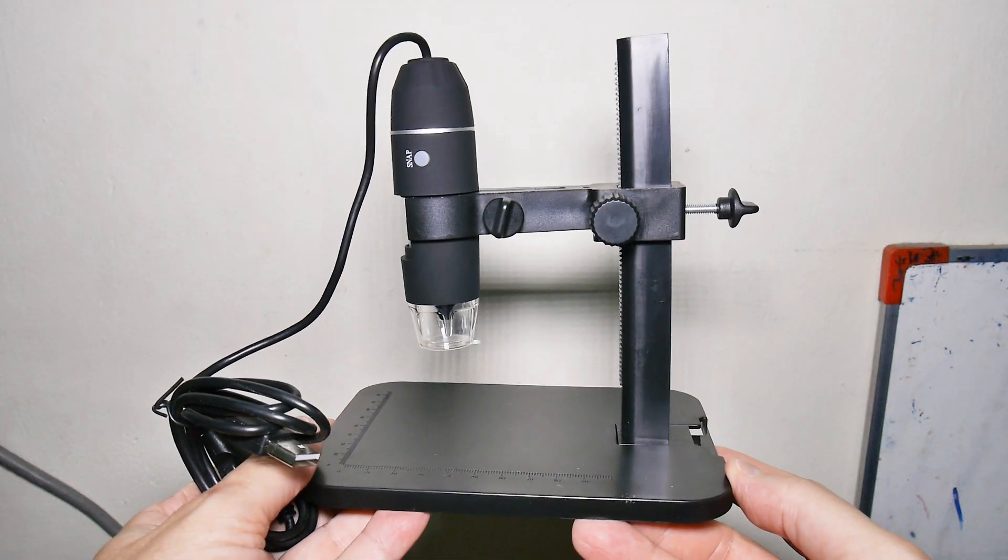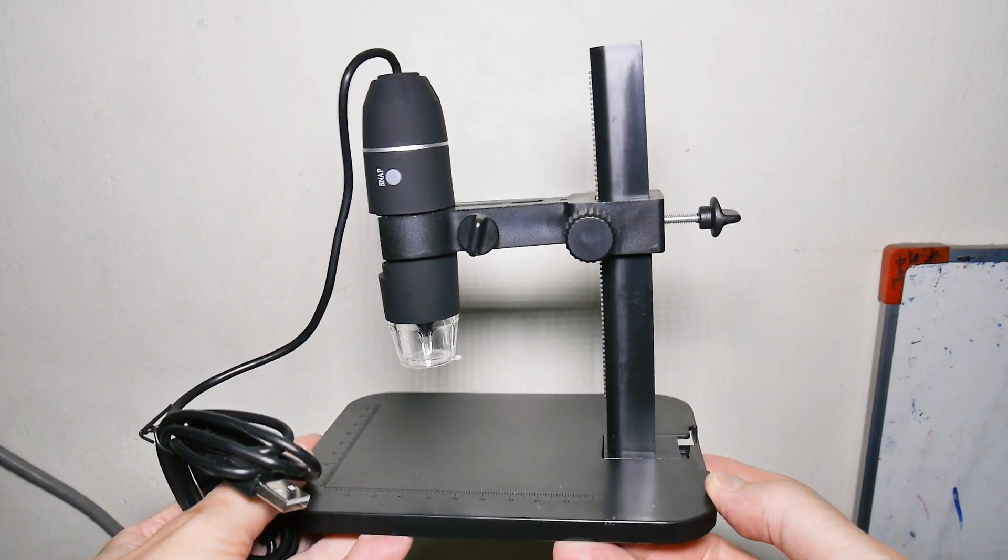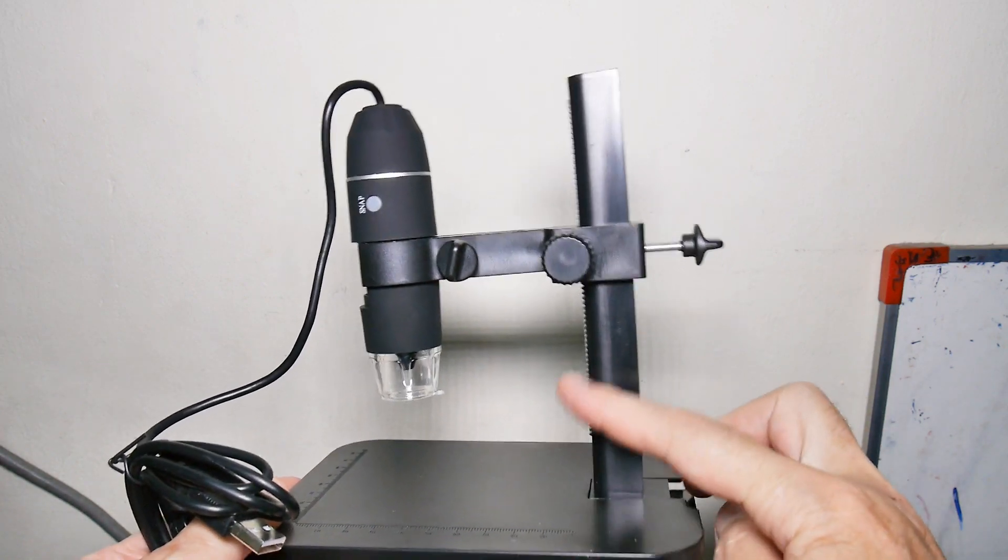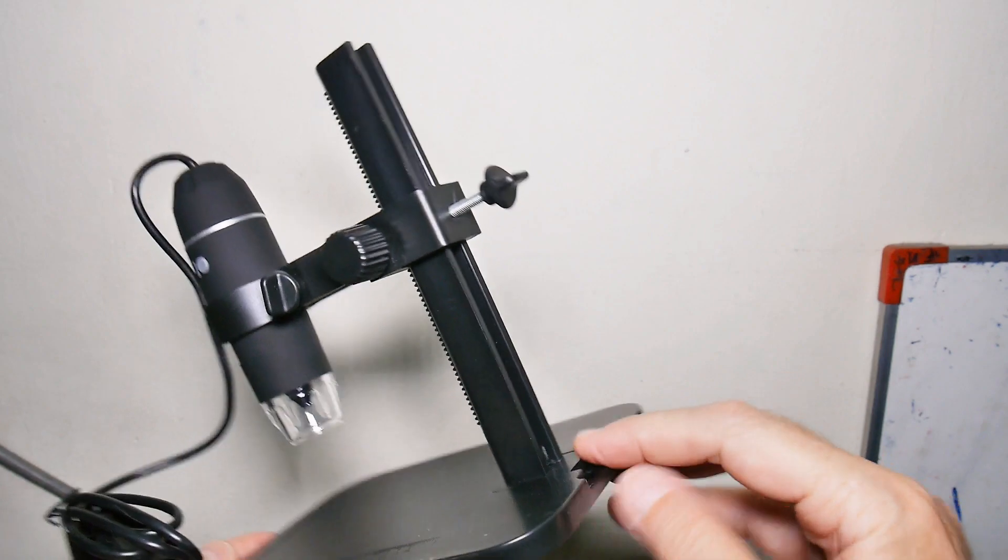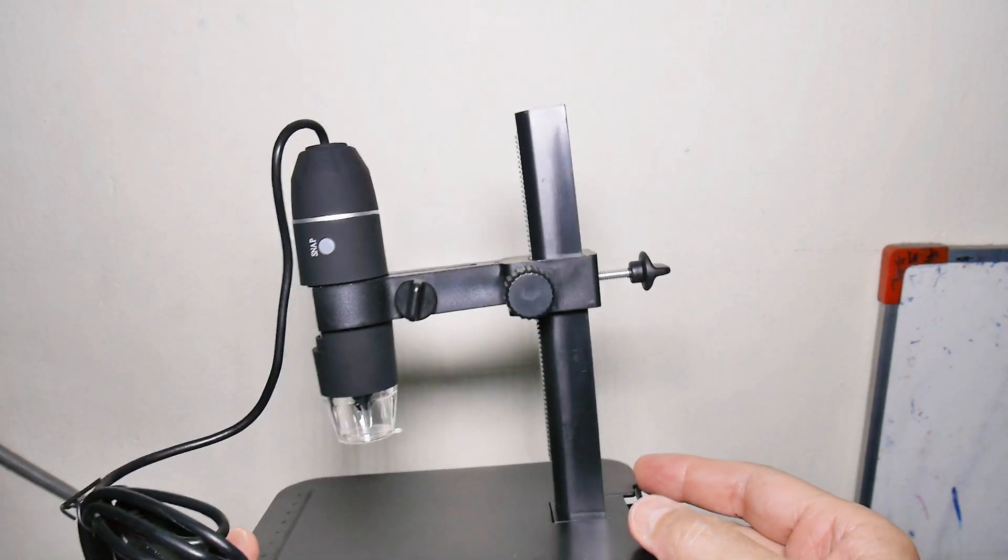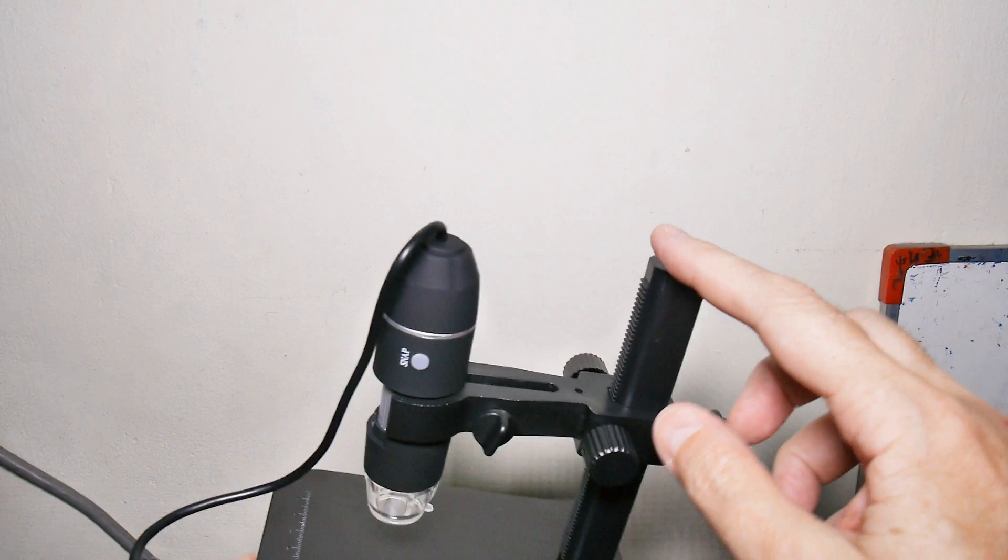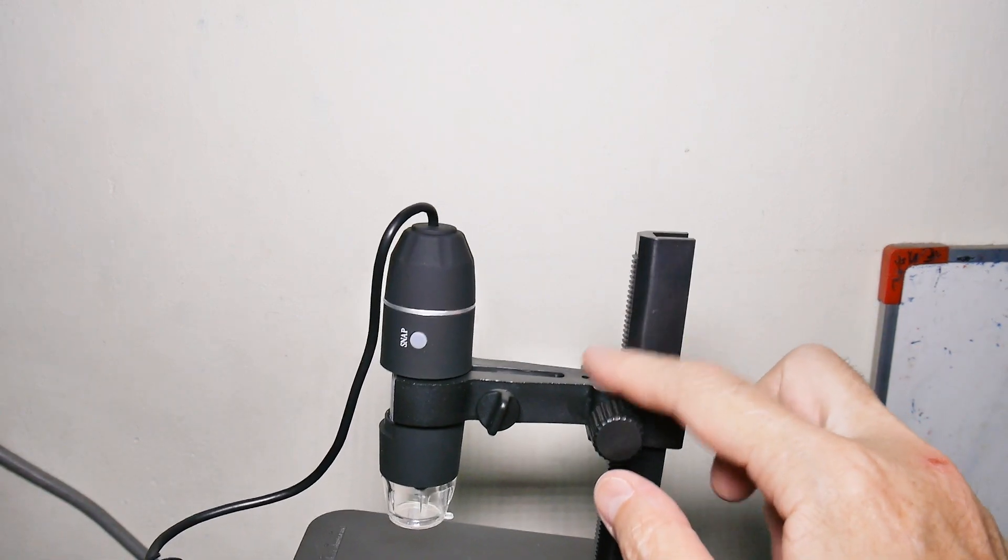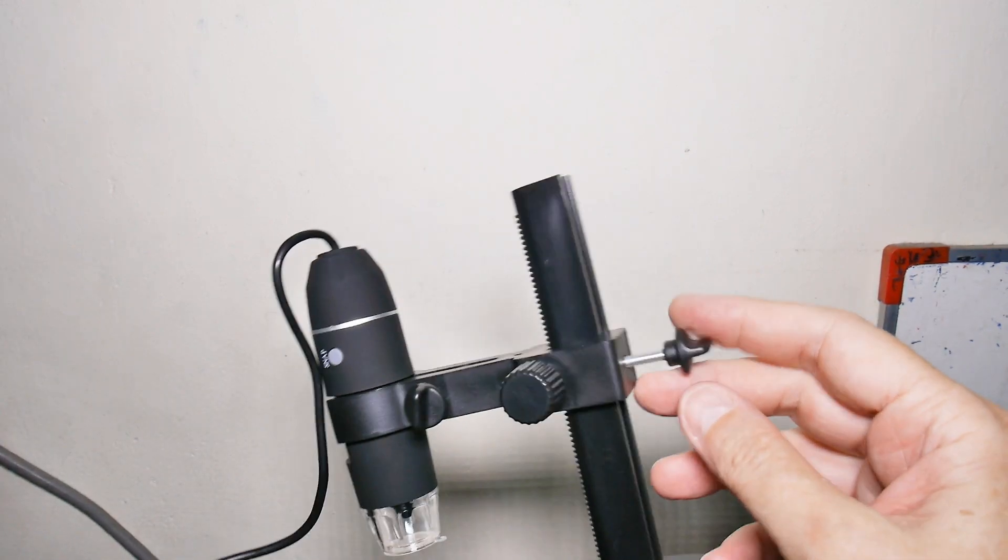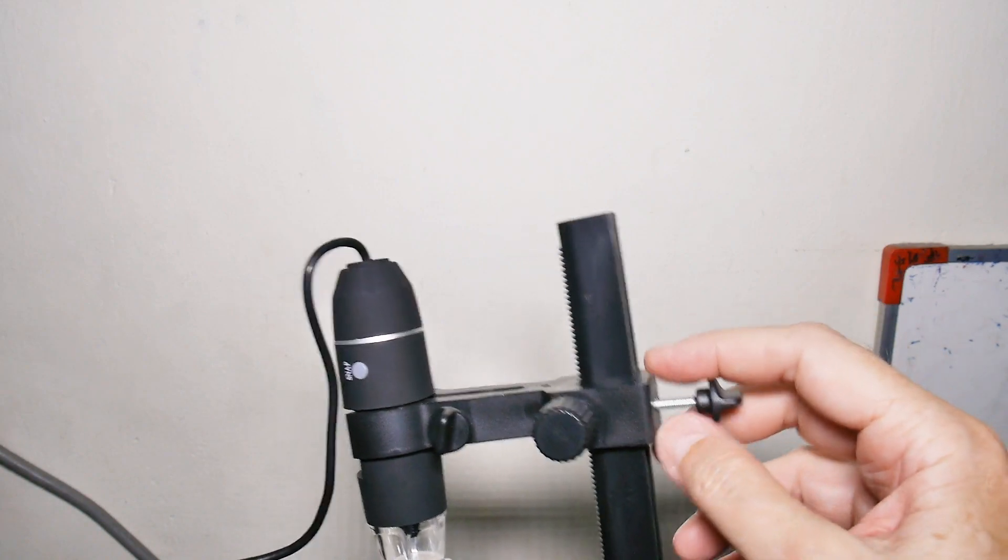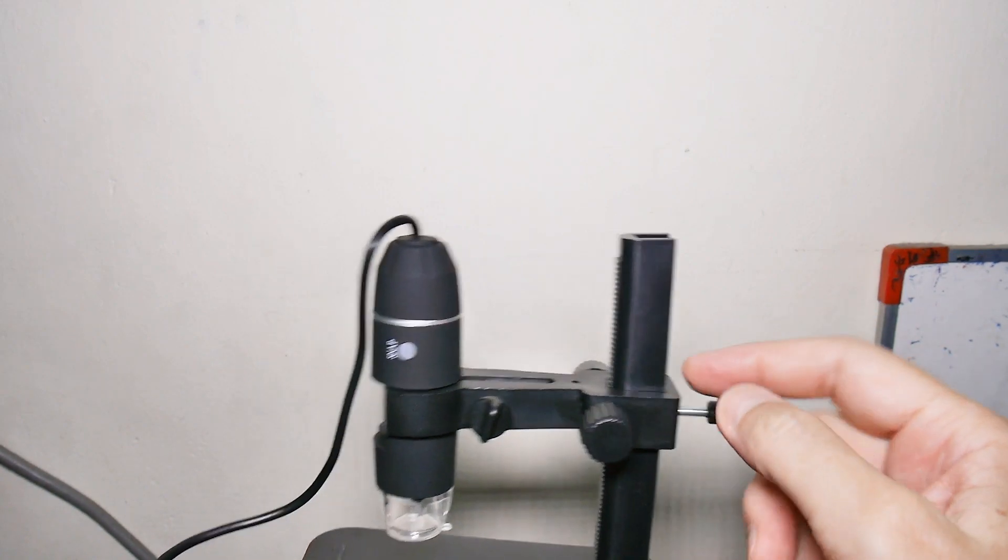The first thing I did is I slid this vertical into here. There's just a slot - slides in there and goes click. Then I put the horizontal on there and just push it on and engage the rack and pinion.